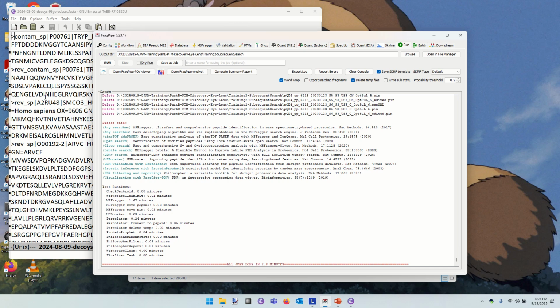That's very good, yes. It's kind of inarguable that a DDA experiment produces X spectra. You can compute how many tandem mass spectra there are pretty easily. There are lots of quality tools out there that'll do it. I've written some of them. But if you know how many tandem mass spectra you've got, then it becomes possible to say, what fraction of these have I identified, right? So if you have 7,000 PSMs and 12,000 spectra, you should feel pretty good about that. Identifying half your spectra is still a pretty good mark to hit.